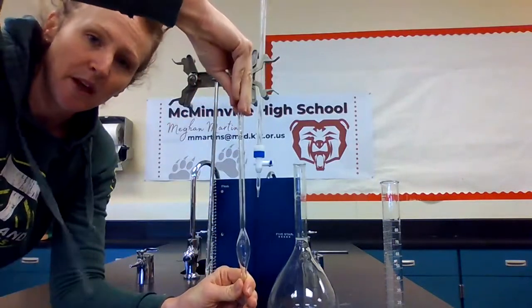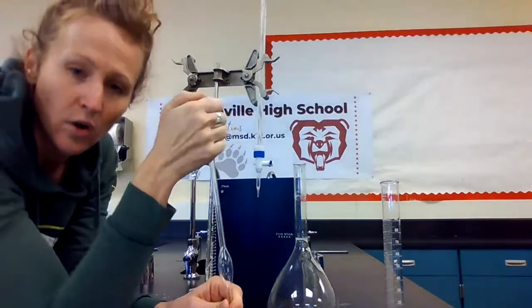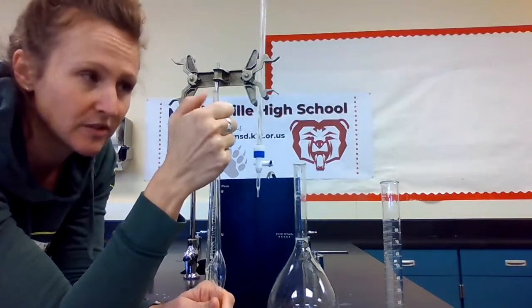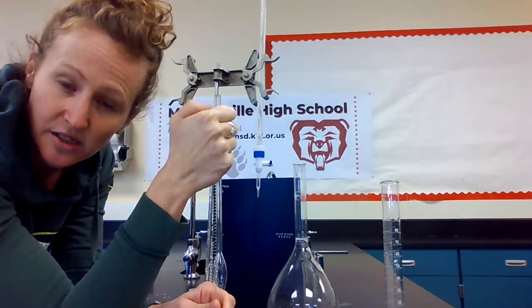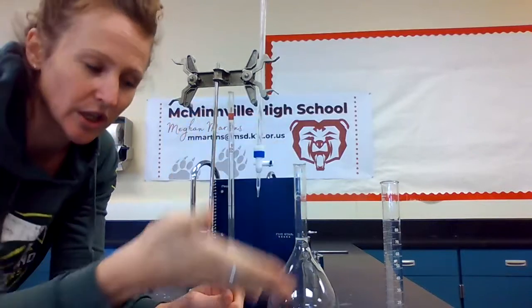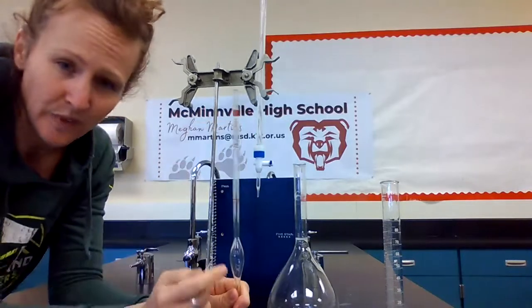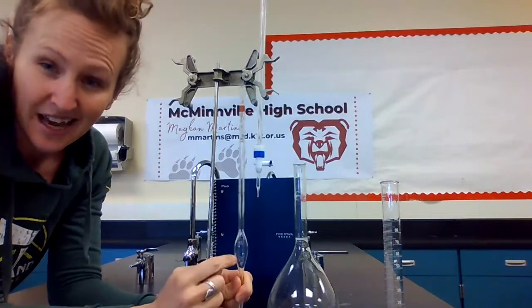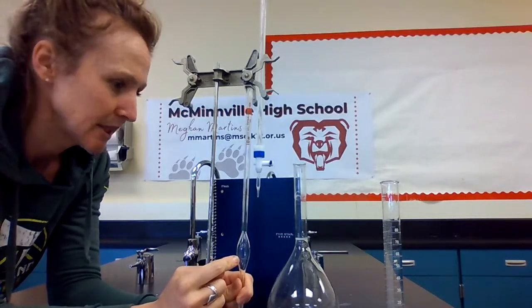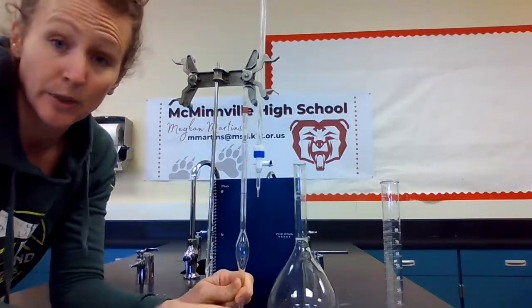You also need something up here like a bulb to suck up the liquid and then squeeze it back out. Or in biology, especially when you're using super tiny amounts of volume, a lot of times we attach a rolling wheel here, and the rolling wheel allows us to control how much liquid we pull up and then dispense out of a pipette very carefully. We're not going to use pipettes this year in chemistry, not this kind, at least. But it's good to know the difference between a pipette and a burette.